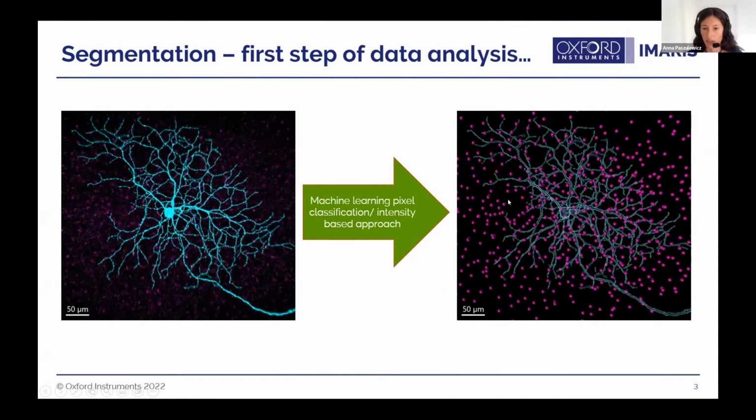So this is just the object detection, but what can you actually learn from the data? Here, the data looks very random. The researchers were interested if there is any connection between the distribution of amacrine cells and retinal ganglion cells.